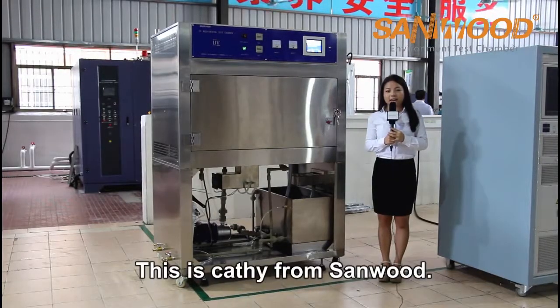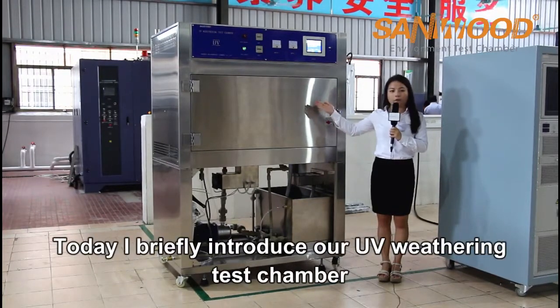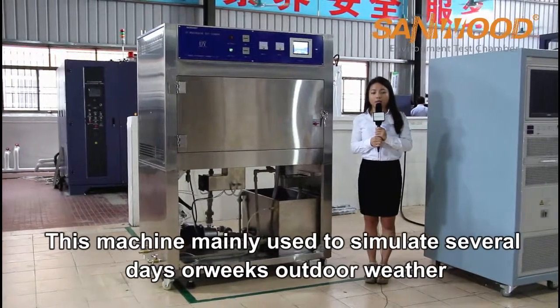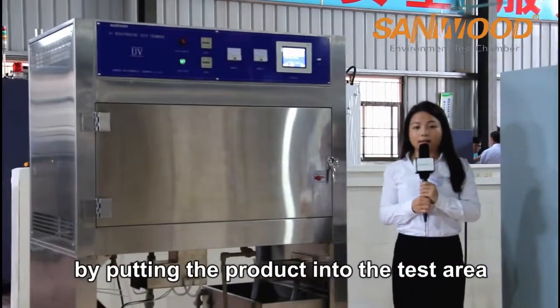Hi friends, this is Cathy from Sanwood. Today I'm briefly introducing our UV weathering test chamber. This machine is mainly used to simulate several days or weeks of outdoor weather by putting the product into the test area.